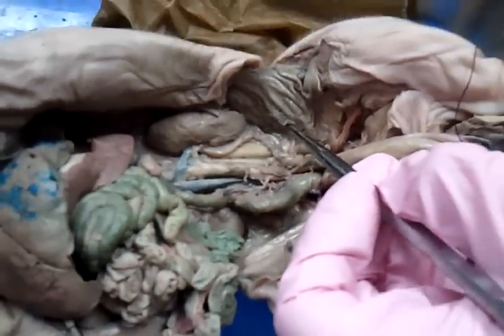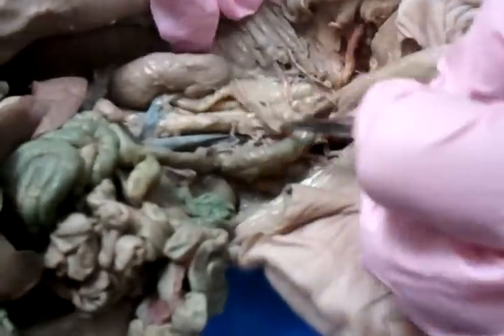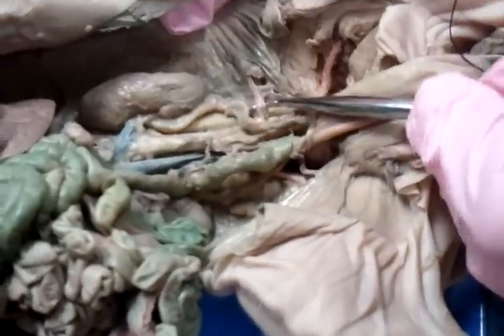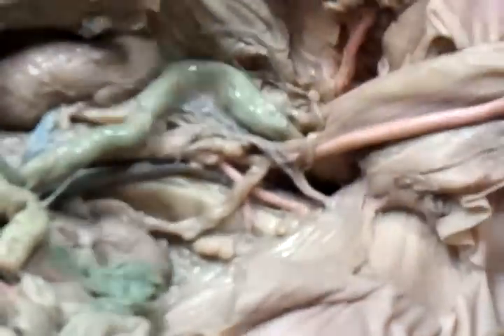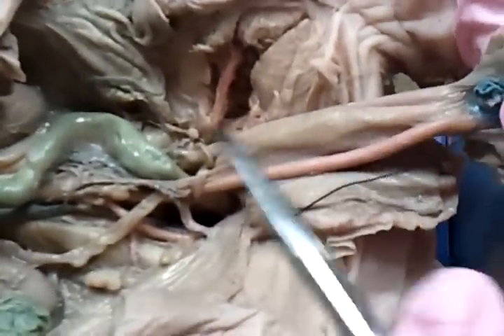Iliolumbar. What's the ilium? It's the big hip part of your hip bones. Lumbar, the back. So if you trace over your iliolumbars, we've got these vessels going over here, and they're actually going to the back muscle walls. You can see them on this side too, down here. All right? Iliolumbar, again, muscles of the back. Umbilical arteries, really easy. Here's your urinary bladder. On either side are your umbilical arteries. And your umbilical vein's not on your list, but it would have been here and attached up at the liver. They've tied it off.